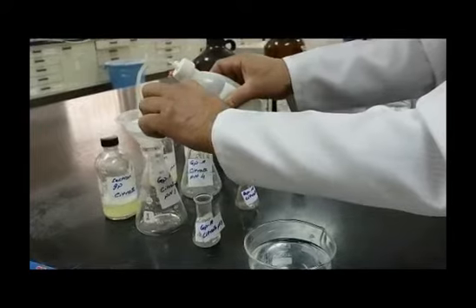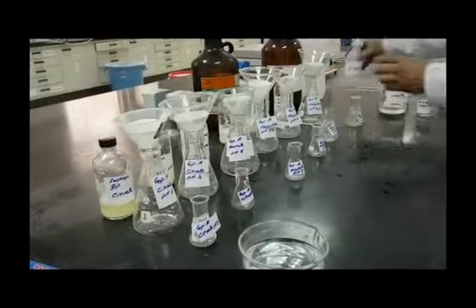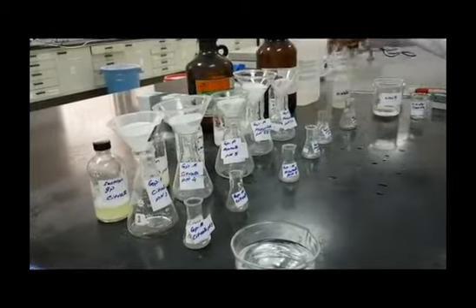Now discard the remnants from each filtration assembly, Erlenmeyer flask.